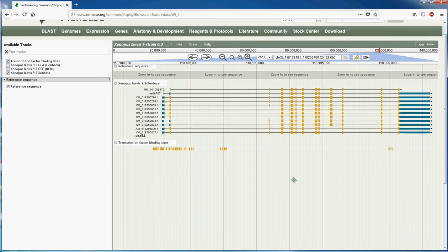Now, if you're talking about saving transcripts for the gene here, whether you want to include or exclude introns or different UTRs or other segments of the transcripts, I'll be demoing that for you in another video. But this is just to save the background data for the entire window of interest in these coordinates that you're looking at.